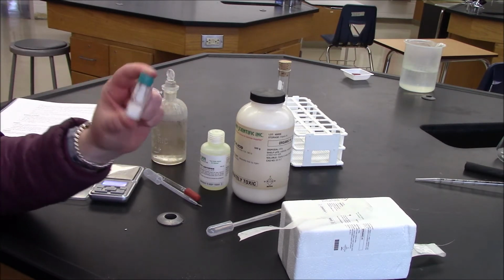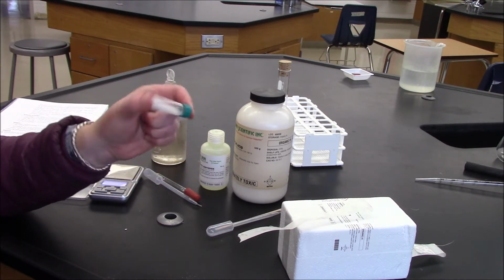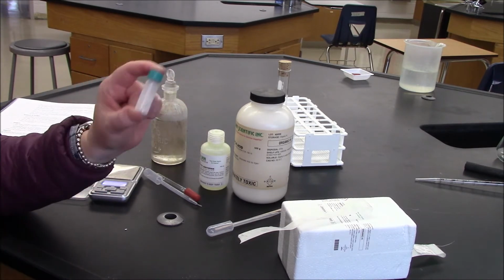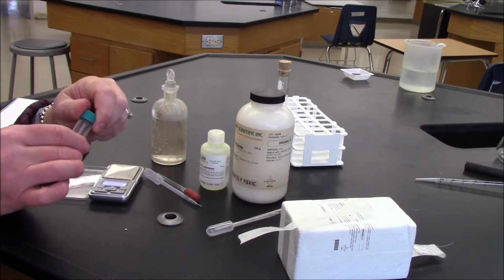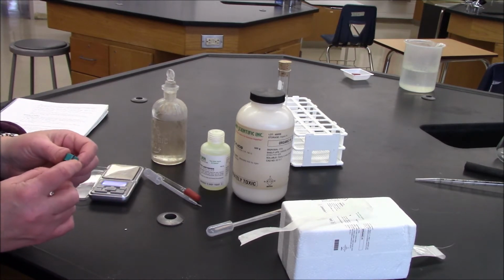Shake it. Okay. Tighten it one last time. Now I'm going to add my copper wire handle and set it up for my 10-minute incubation period.